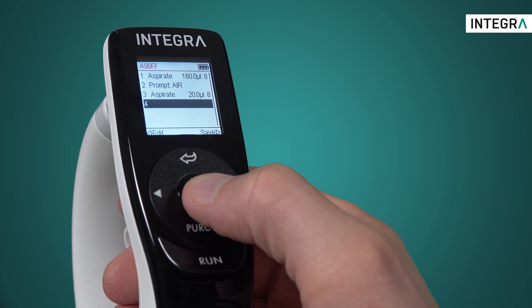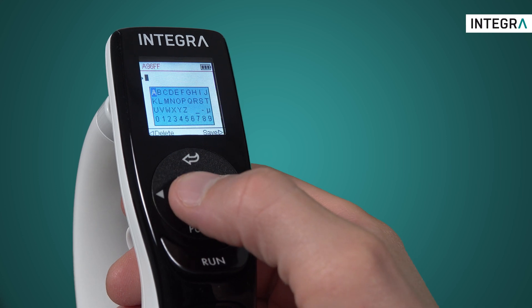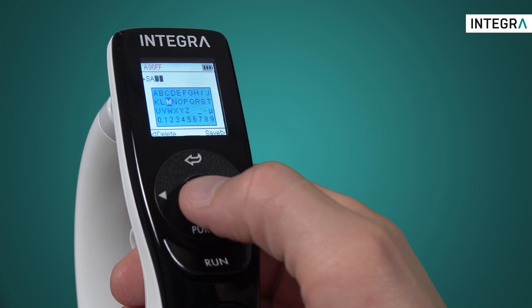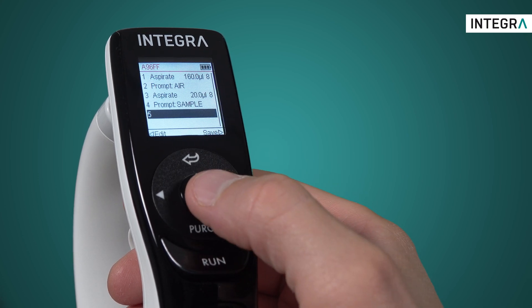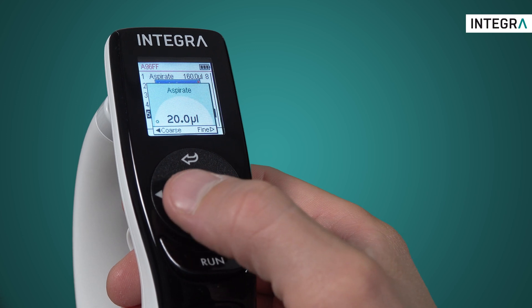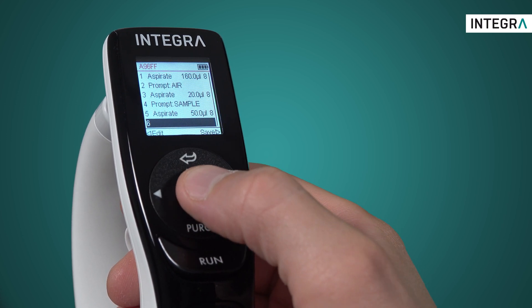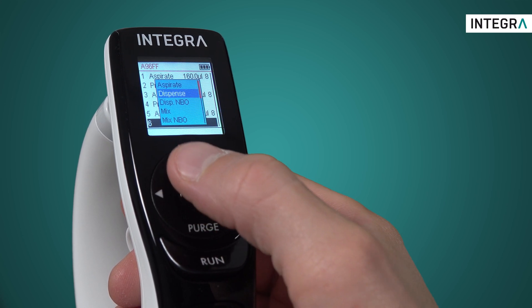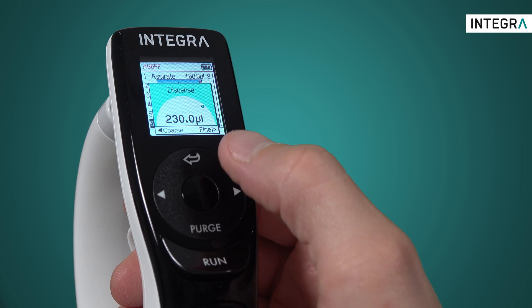Next, we'll add another text prompt which tells the user that the sample is next. And then we'll aspirate 50 for our sample. We'll have to dispense all of this now into our plate, so we'll program Dispense 230.